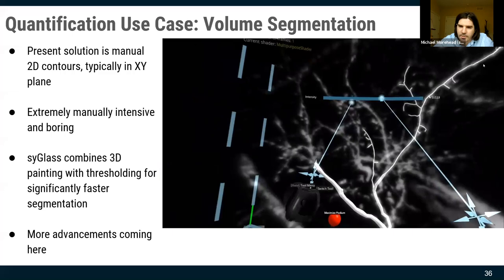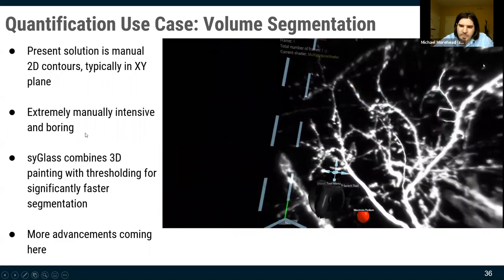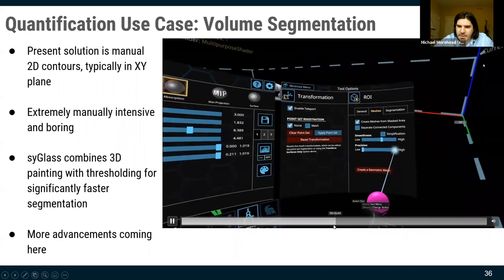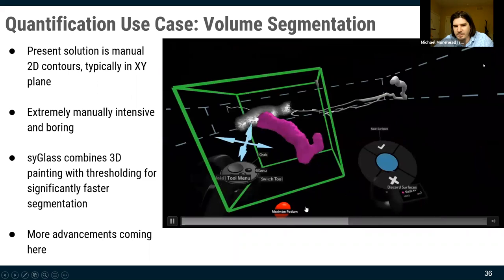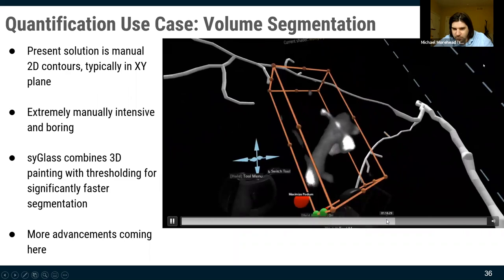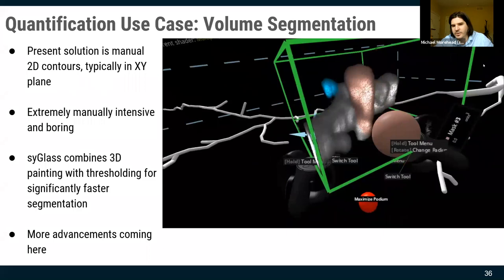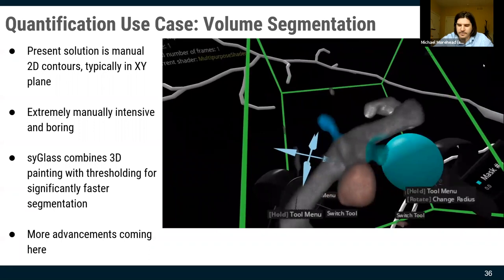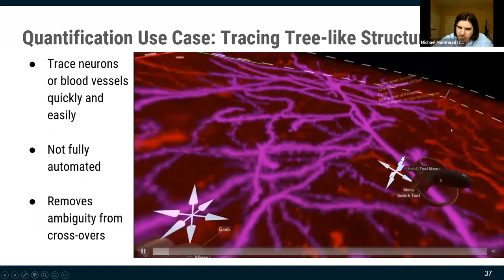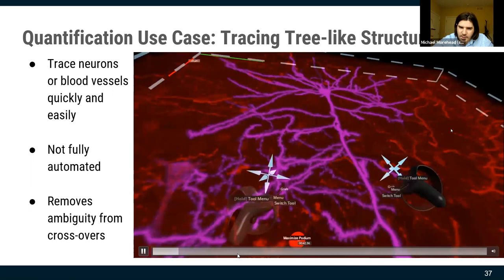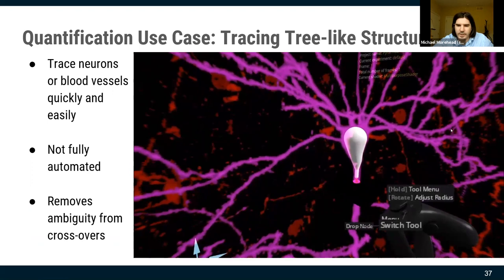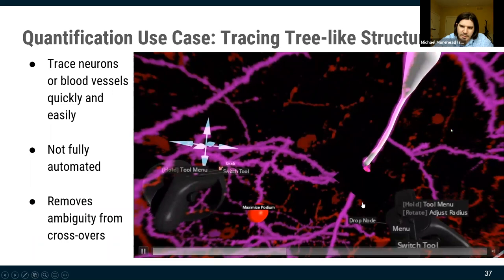We can also do volumetric segmentation. Neuroscientists want to understand the shape of dendritic spines, so we made a volumetric painting tool: you place a region of interest around data, bring in a painter, highlight structures with different colors, and we've implemented marching cubes so you can turn them into meshes. For understanding branching structure of neurons, we built an automated tracing system that snaps to the brightest thing in the scene.